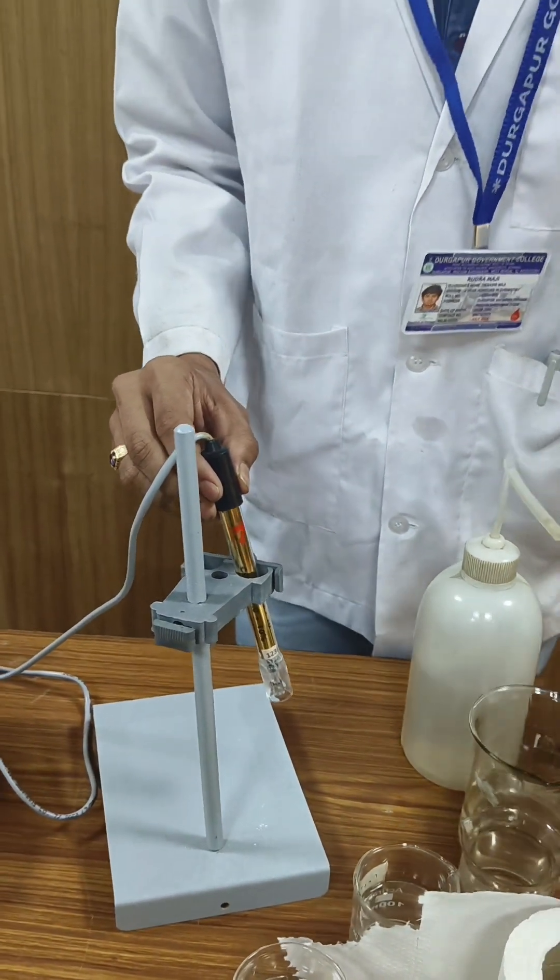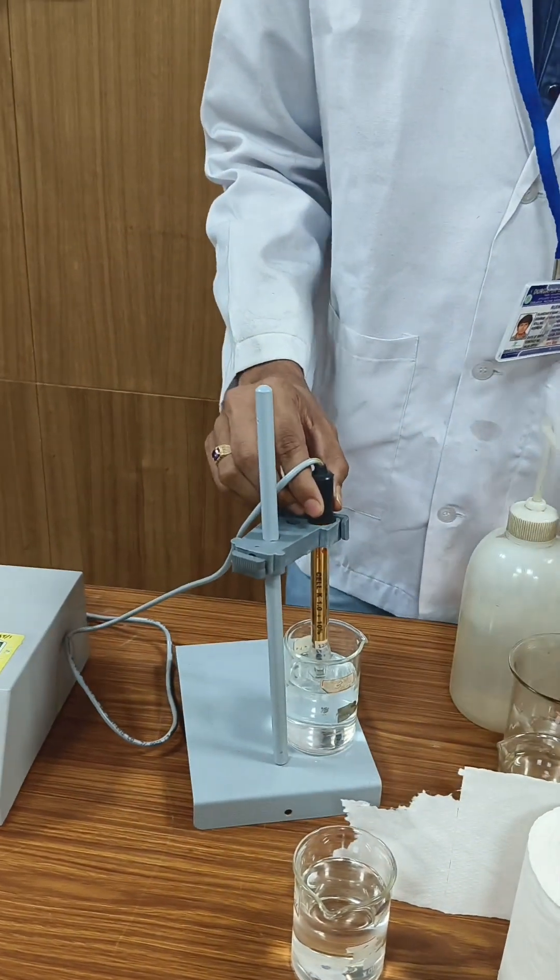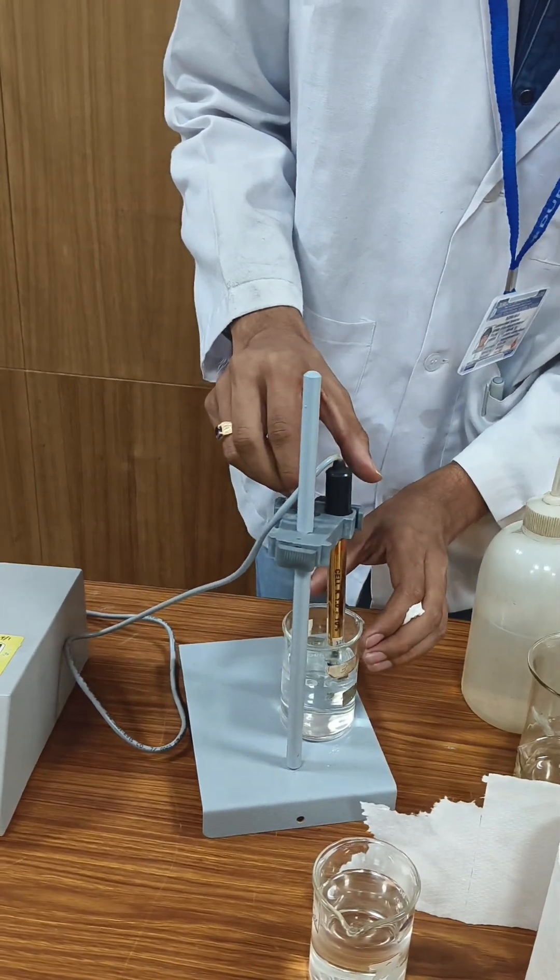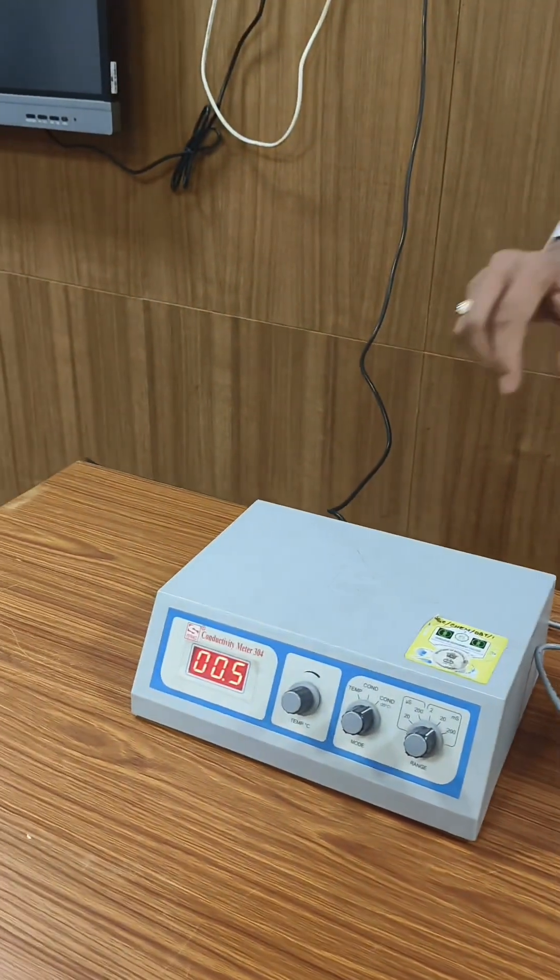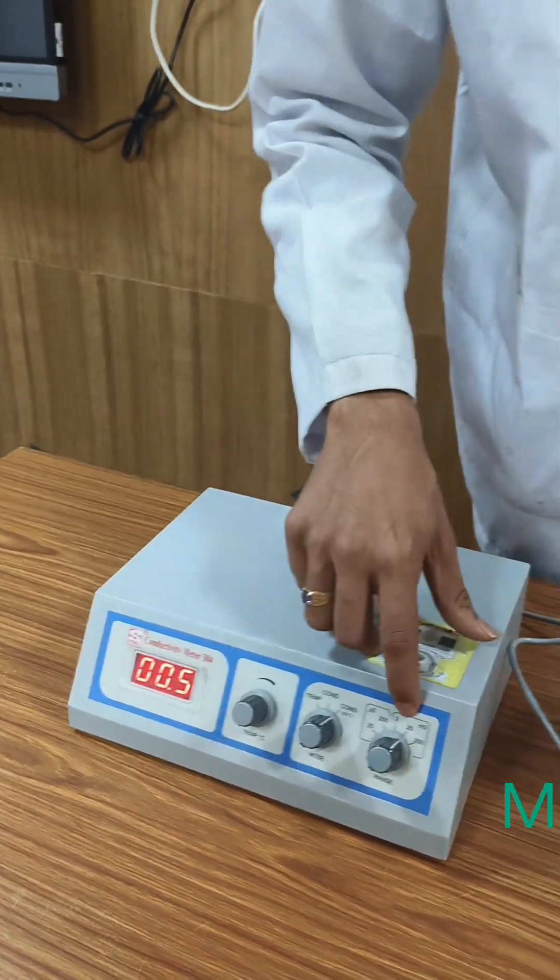Now we measure a water sample's conductivity. We can see the first sample conductivity is 0.5 microsiemens.